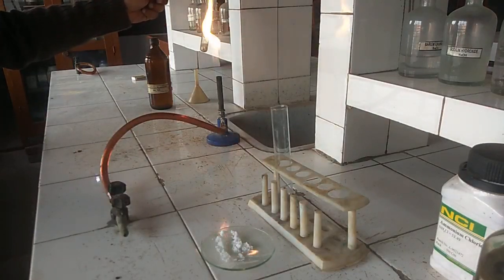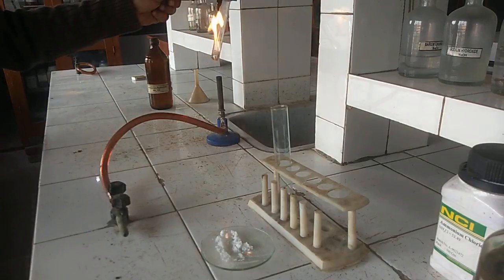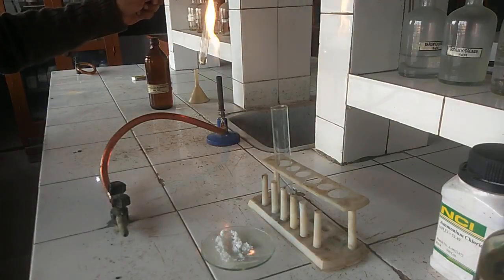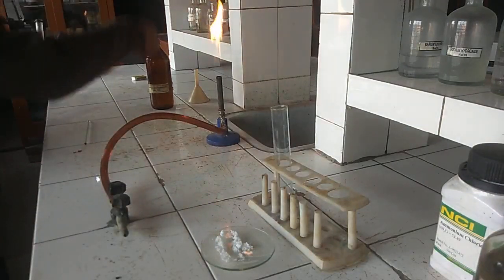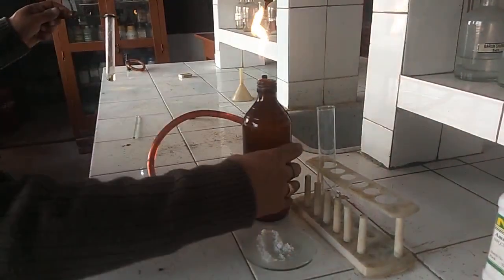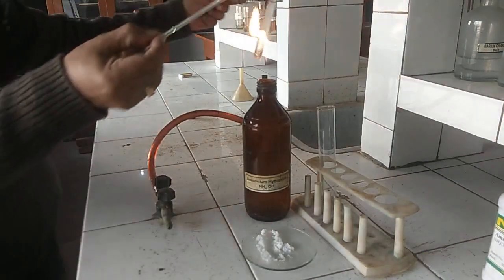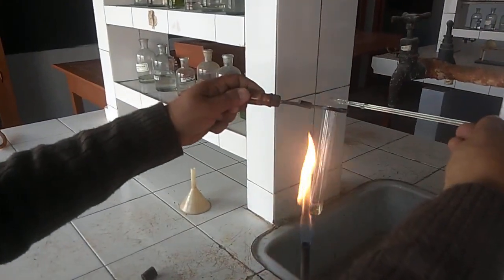On heating, a colorless pungent gas evolved, which is actually HCl, and we will confirm the presence of this gas with the help of aqueous solution of ammonia, that is ammonium hydroxide. Again we will dip a glass rod in aqueous solution of ammonia and we will bring this glass rod over the mouth of the test tube.